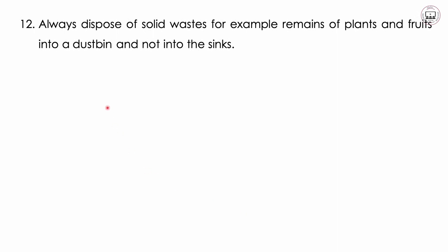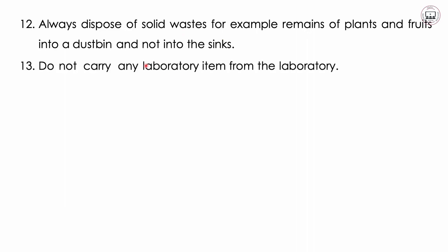Then 12, always dispose solid waste, for example, remains of plants and fruits, into a dustbin and not in the sink. This is contrary to what we discussed in point number 11. That one was telling you not to dispose of hot substances into dustbins, but these solid wastes are supposed to be disposed in the dustbins, not in the sink. 13, do not carry any laboratory item from the laboratory. Those are used in the laboratory and they are supposed to be kept in the laboratory.